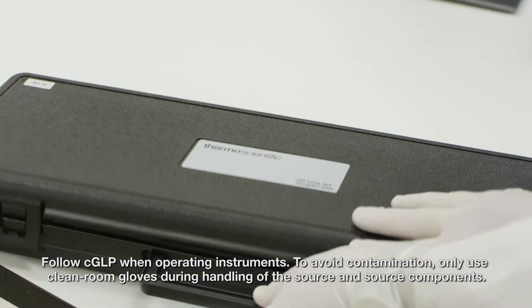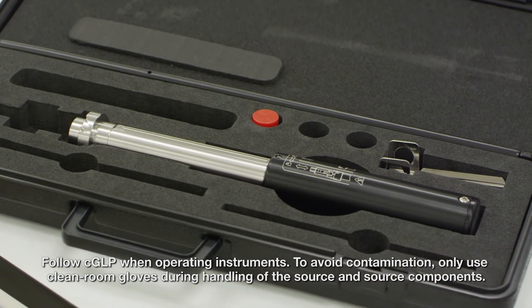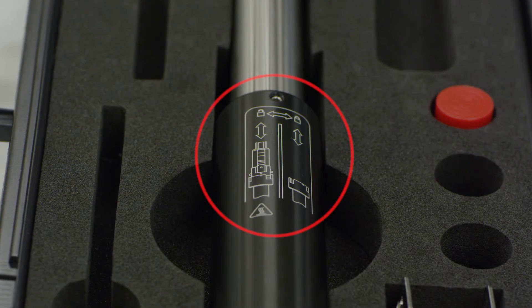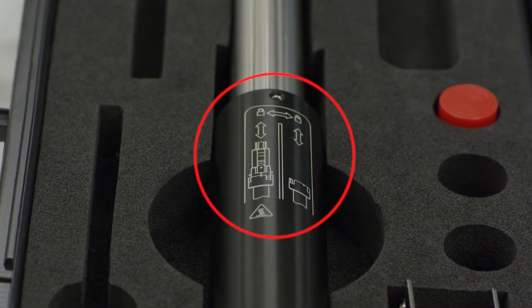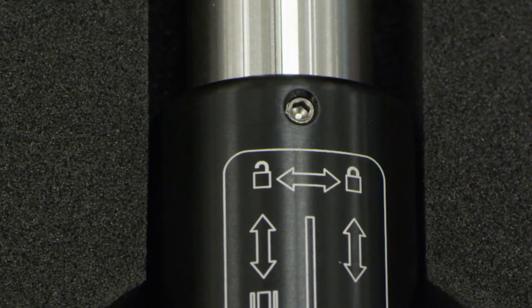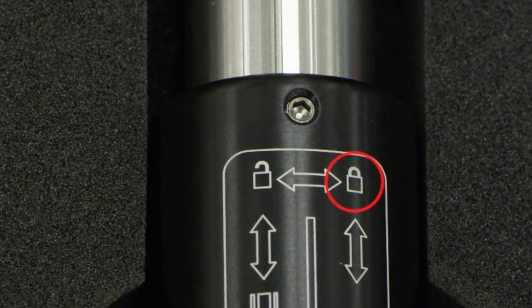To begin, acquire the source cartridge installation tool. On the top of the tool there's an illustration for operation. Since we are beginning without a source cartridge attached to the tool, the indicating screw in the middle should be aligned to the right, or locked channel.